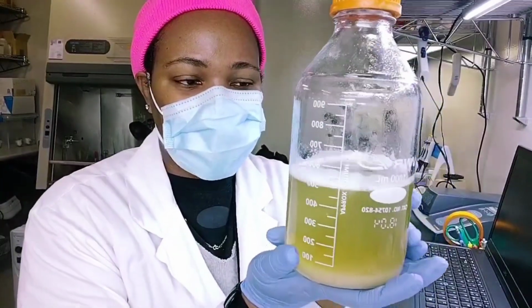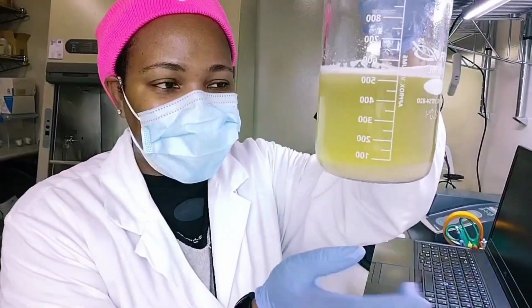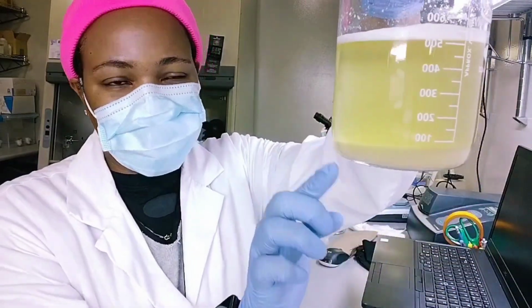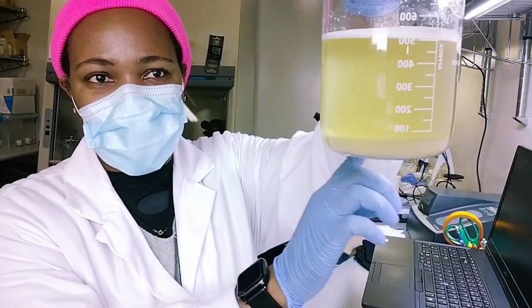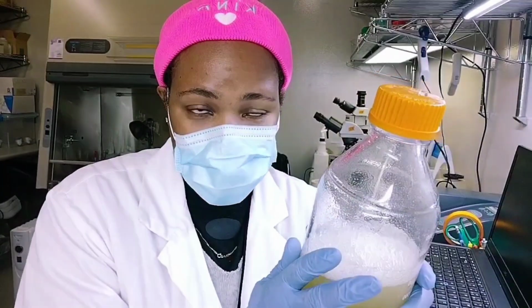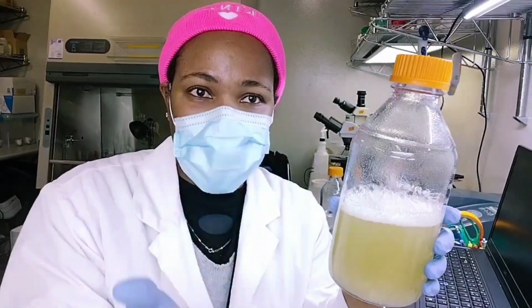This is what the finished product looks like. They all start as soup, right? The broth. But this has agar, and because agar is solid, it precipitates out of solution. So that's a white, tan, cream solid rim at the bottom. Before I sterilize it, I'll give it a good shake, and then once it goes into the autoclave, it cooks without burning, and the agar gets dispersed and everything is mixed.